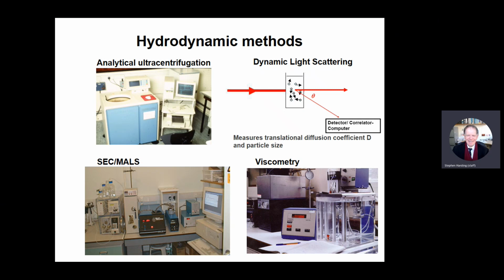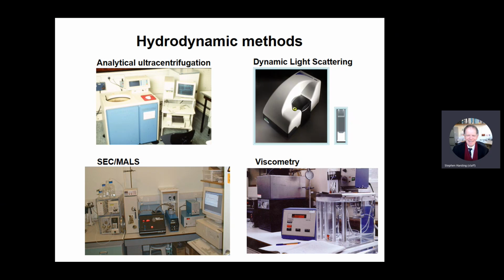just briefly, dynamic light scattering first, and we put our solution in a cuvette. Some DLS instruments, you inject the solution through an injection port, but in the Malvern nanosizer or zetasizer system, which we've got over in the NCMH, it's cuvette based.